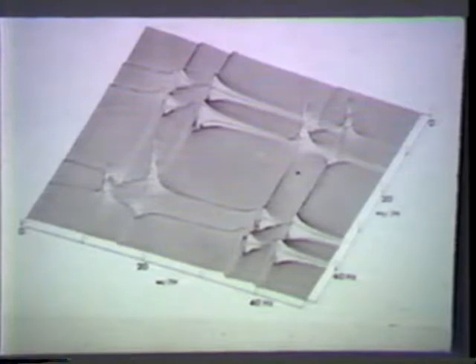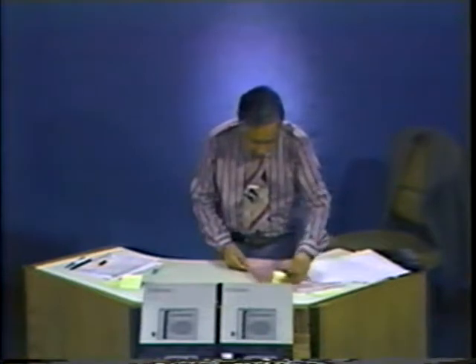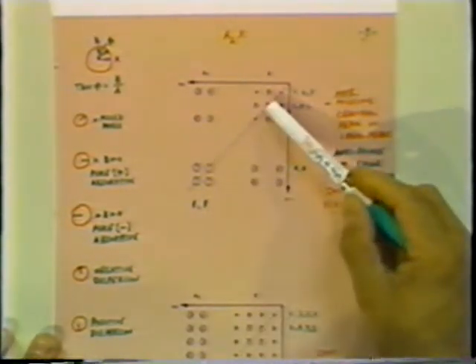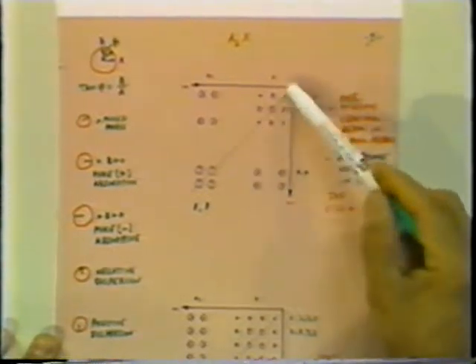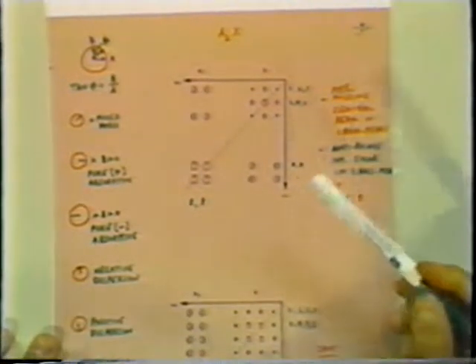Okay, that is the two-spin system COSY spectrum. I show you a schematically drawn spectrum for an AX2 spin system, or A2X, which will have this pattern. A2X has a doublet for the A2 and a triplet for the X, and therefore there are 9 peaks in the X region, and there are 4 peaks in the A region. The cross peaks are somewhat interesting.